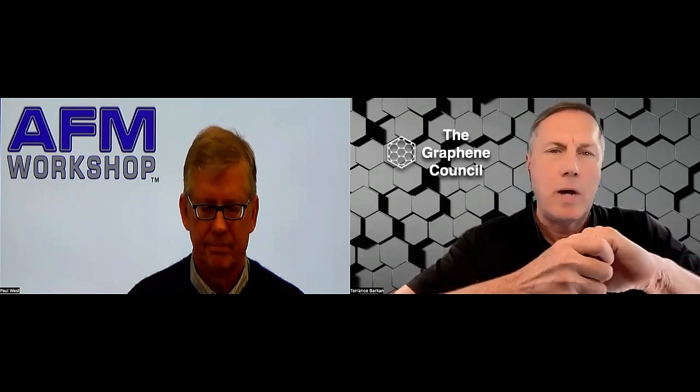That's interesting. There's a question here that says, from TEM images, we know that graphene flakes can be wrinkled. We also, just from what the Graphene Council has done, and we do a lot of material testing, by the way, not ourselves directly, but we work with labs that do the characterization, there's material, for example, that might be turbostratic, right? And it's got different morphologies, kind of looks like an onion ball or something like that, many dimensional. Do those kind of morphologies of the particles that are being measured pose any unique challenges for AFM?